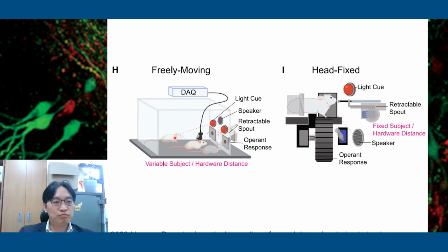we can actually see the mouse moving around, approaching the reward or moving away from the reward or threat. So this locomotion of a mouse gives us more data, more insight by using this freely moving design. So yeah, in theory, I think freely moving has a better advantage. Yeah, for those two reasons. We can have the locomotion part, and it's more naturalistic. Now you can measure the motivation of the mouse using freely moving much better than head fixed.